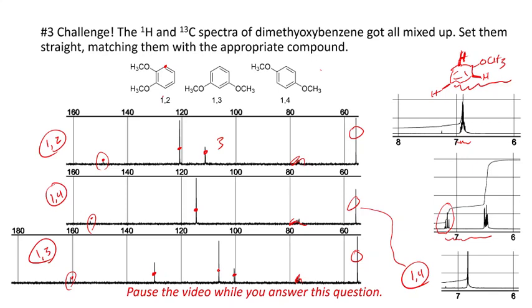And so let's just see what we have in this case. For this top methoxy here, that would be these positions, only 2 of which have hydrogens. And for the bottom one, that would be these positions. But notice we've indicated all 4 hydrogens should be shielded.